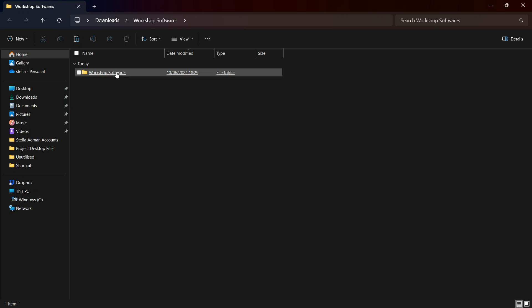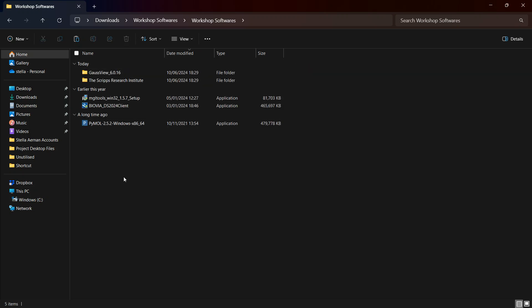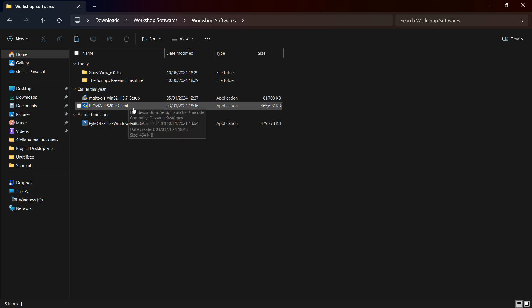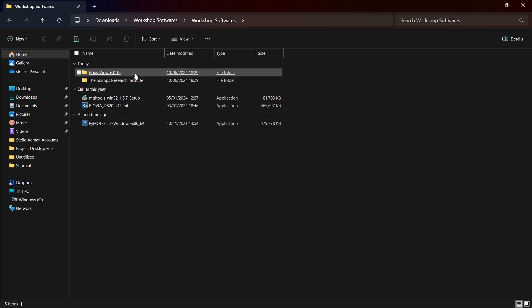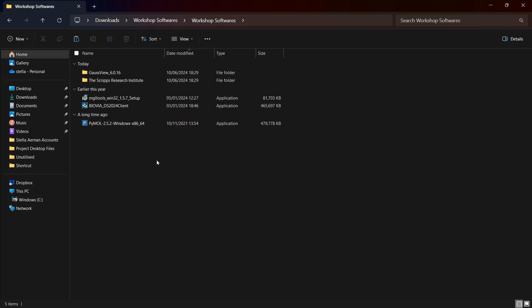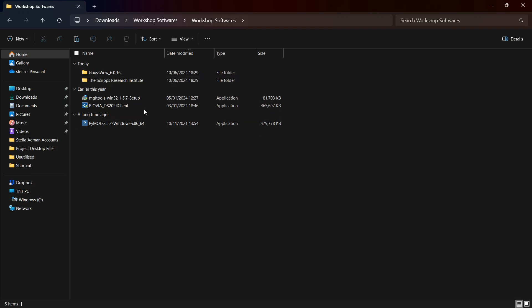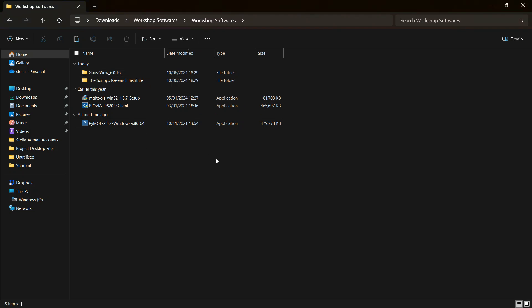Once extracted, you will find the different softwares inside, which are AutoDock Vina, BIOVIA Discovery Studio, PyMOL, and GaussView — these are the workshop software. During the course of the workshop you are going to be learning about these tools and how to use them. We will first start with the installation of AutoDock Vina.